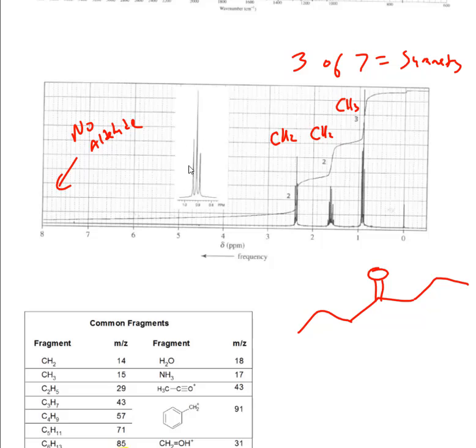Don't think this is a reading. See how it's elevated up in the air, and it's got its own numbering? That means it's a zoom in of one of these. That's all. Okay, question number 4.